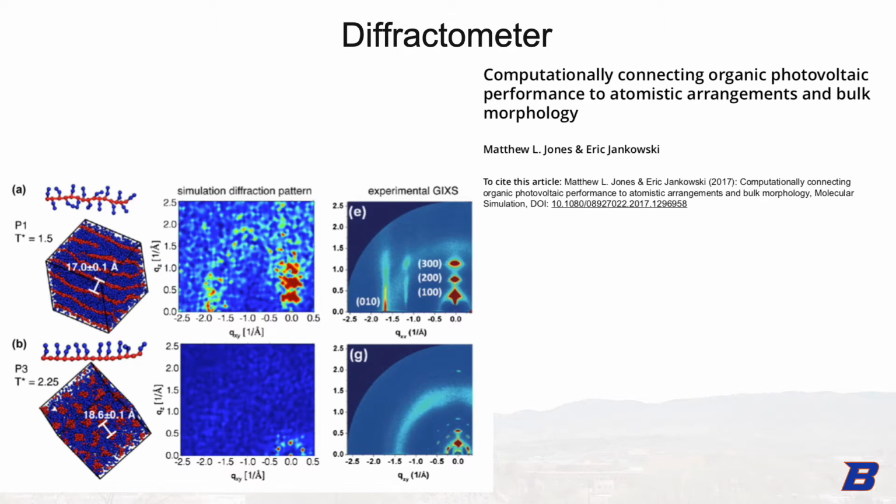of the system. However, when looking at these simulated diffraction patterns, it was not always immediately obvious what view of the real space structure correlated with what diffraction pattern, and additional work had to be done to get that information back.